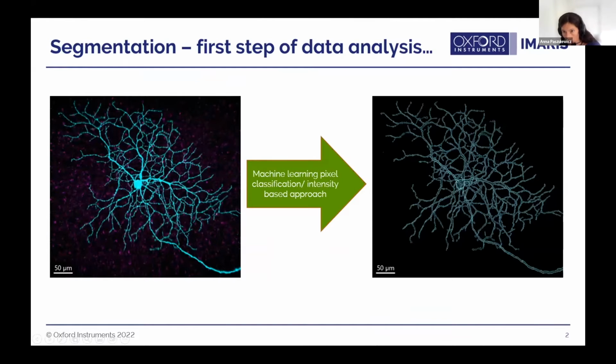Okay, I think I need to. Can you see the panel on the right, or is it? No, okay. We see your slides perfectly. Right, okay.